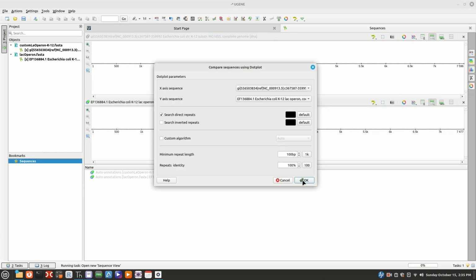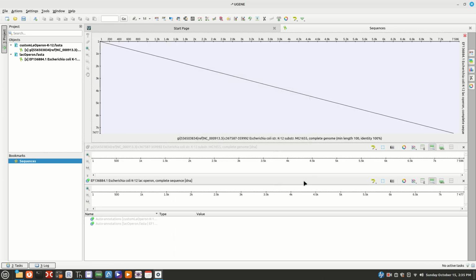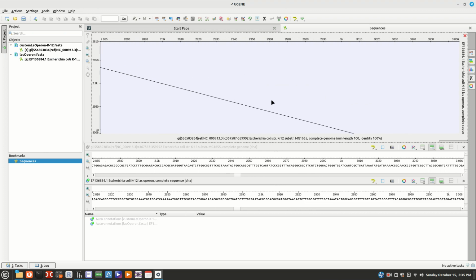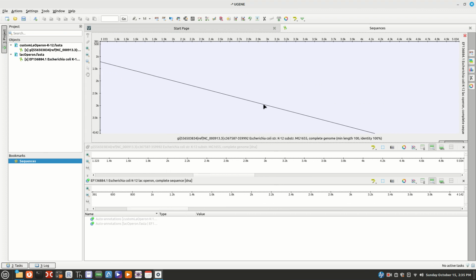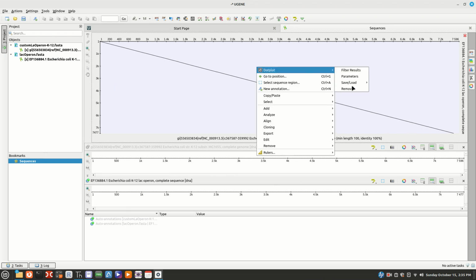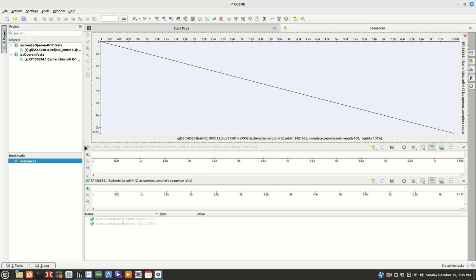All right, we're going to leave it at 100. We don't need inverted repeats. I just want to look at it, and I want to see if it looks pretty standard. You don't know for sure unless you zoom in, but this thing looks like it's 100%. And it looks exact. Let's see, this is 7,477, and this one is 7,596.